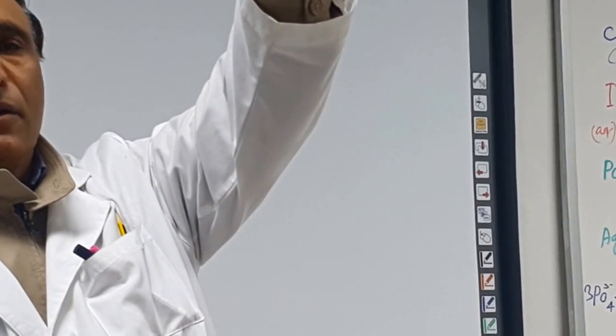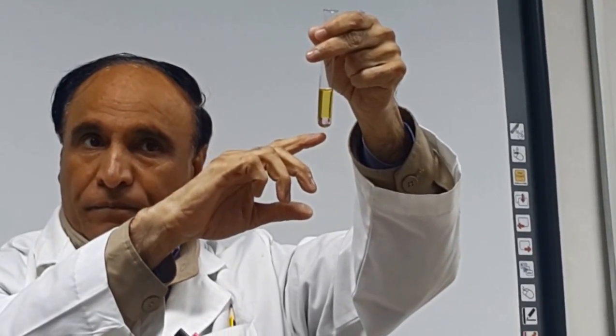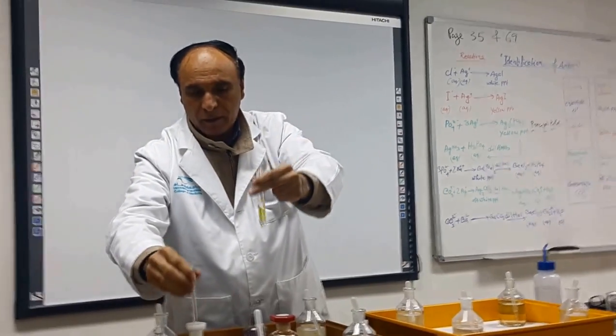Did you see the purple color down? The purple color, iodine is coming down. I can remove all of it. The iodine is going down. It's the purple. I put more. Yes, I can put more.